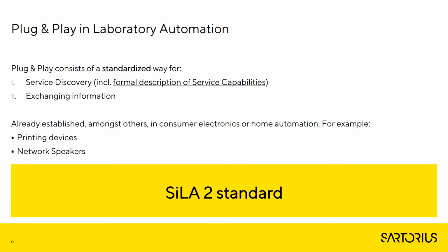For example, the automated discovery and usage of printing devices, or the usage of network speakers, for example, when listening to music over a streaming service. As you all know, SiLA is the leading standardization solution for laboratory automation. The SiLA 2 standard is currently evaluated within the Sartorius Corporate Research Division.